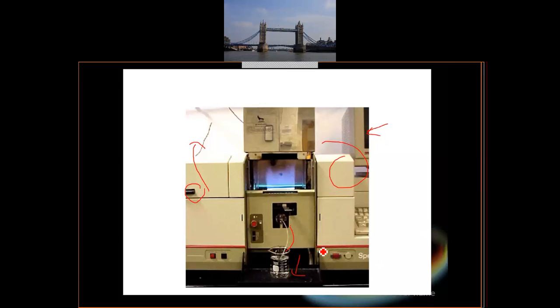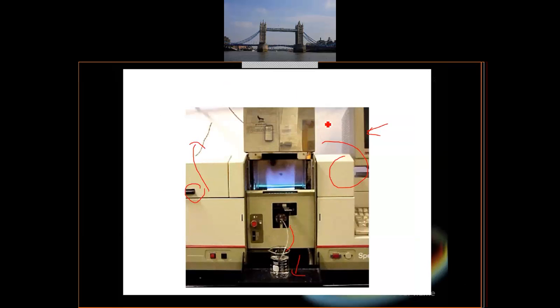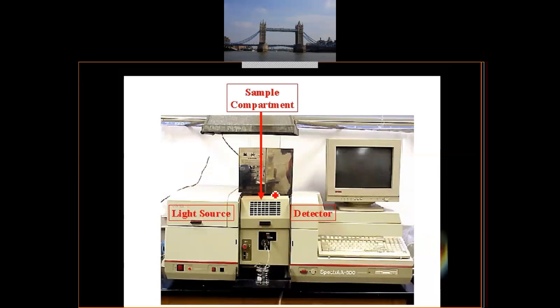Okay. Super kan? And also, this is being opened, the lid is being opened so we can see the flame. But normally when we do analysis, we shut it. Kita tutup dia. Okay, so we can't see it.